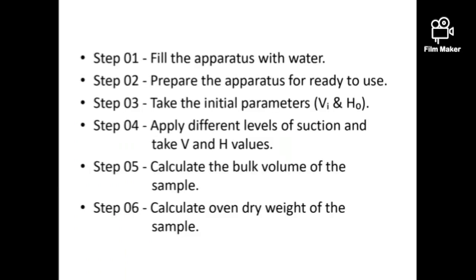Procedure. Here is the brief procedure which can be segregated into 6 main steps.